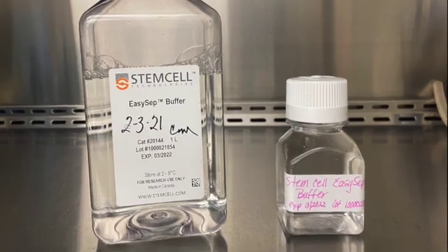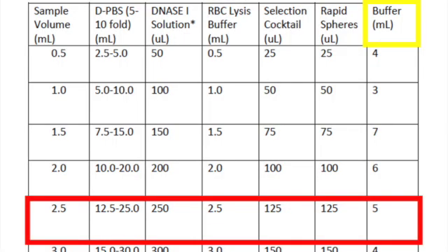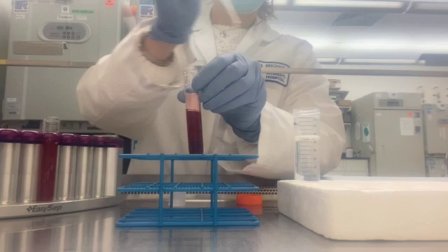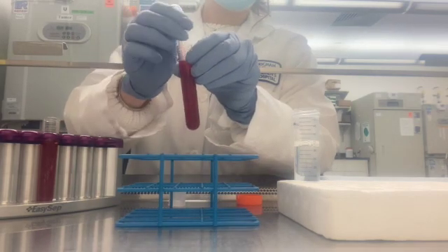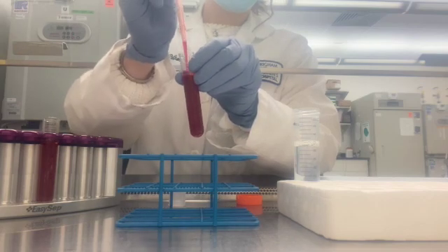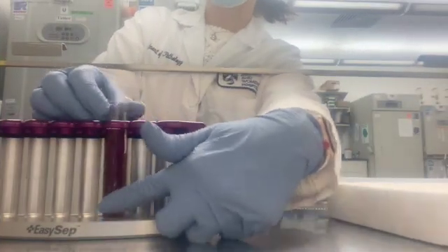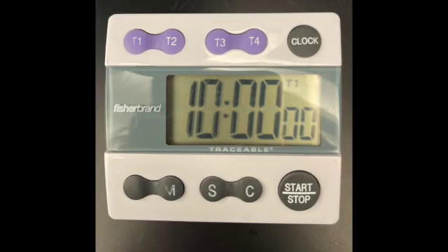Next, we need to top off our sample using the regular EasySep buffer, which is different than the lysis buffer we used earlier. Use the table to figure out how much buffer to add. I suggest using a transfer pipette to add it to your sample. Once you've added your buffer, mix your sample gently and place it into the magnet uncapped. Be sure that the magnet isn't in a spot accessible to the vacuum, because you don't want to move the magnet once you put your tubes inside. Press firmly against the bottom of the tube to make sure it is snug against the back of the magnet. Set your timer for 10 minutes.